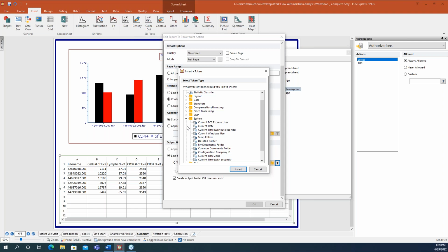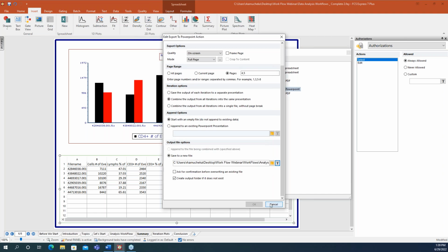Whenever they're doing whatever analysis they're doing, they'll click to work through this analysis. It will import this token. Sometimes I can even use maybe a file name or some kind of descriptor for this experiment. And again, it will create this folder. It will add it and create this reportable right exactly where I need it.